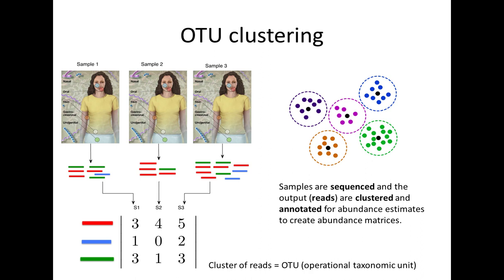So typically, you collect your samples, you run them in the wet lab, you get your FASTA or FASTQ files, and you process them. Now everybody's doing MiSeq, or let's say even HiSeq. You run it through, for example, the QIIME2 pipeline, which strings together all these different tools for creating an abundance table. Traditionally, QIIME2 in particular uses a different method. They use DADA2 by default. But traditionally, you would have OTU clusters.